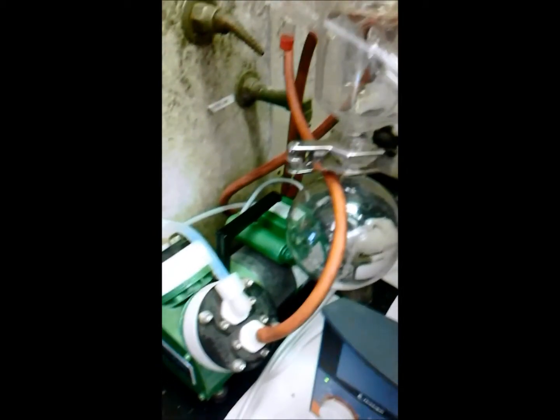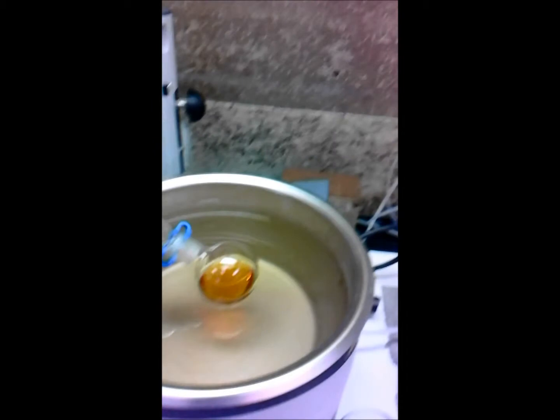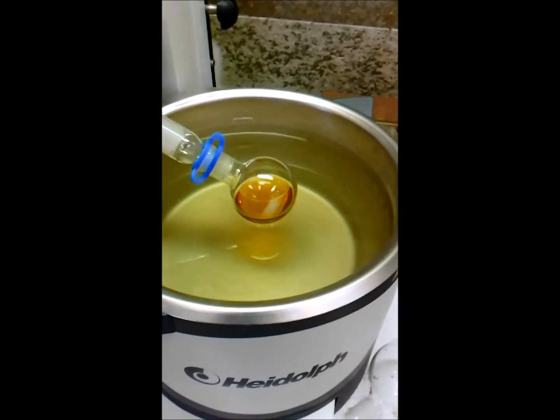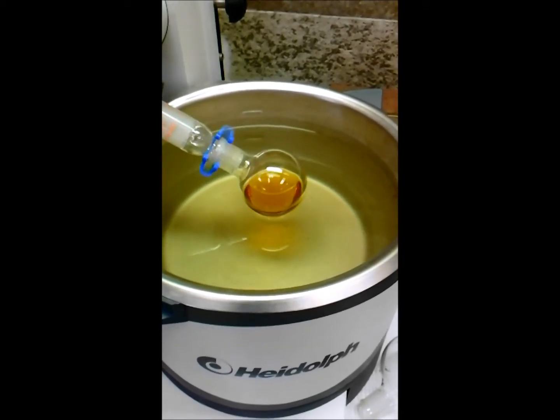So we have a shitty pump, as you can hear, and we have to manually control the vacuum by turning the seal. So it's very prone to bumping sometimes, and it's also loud and horrible.